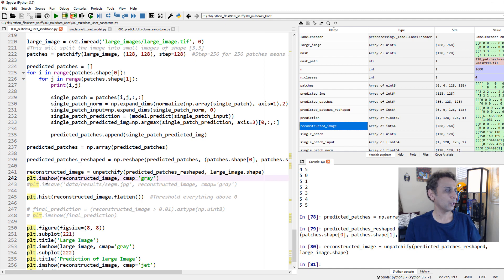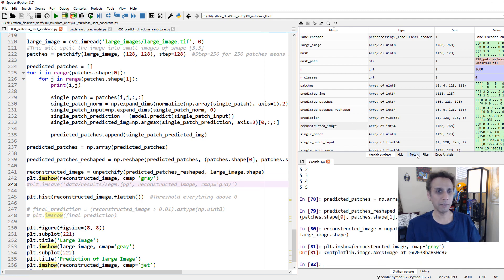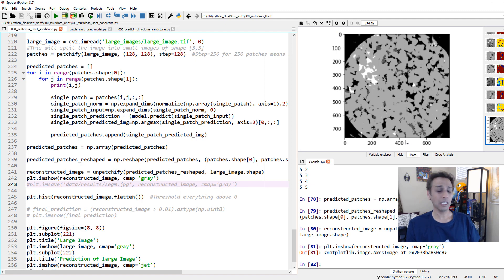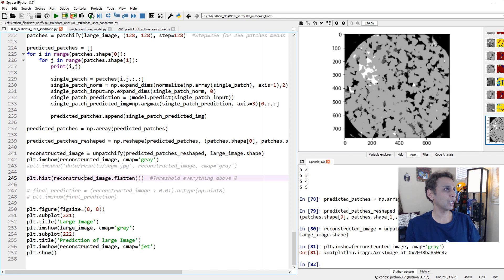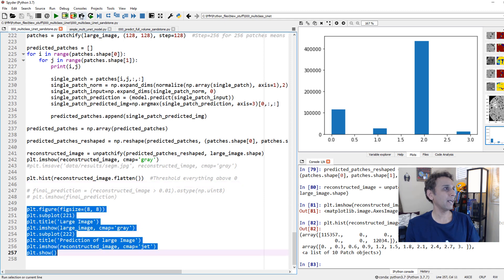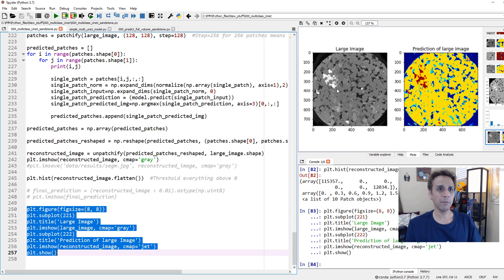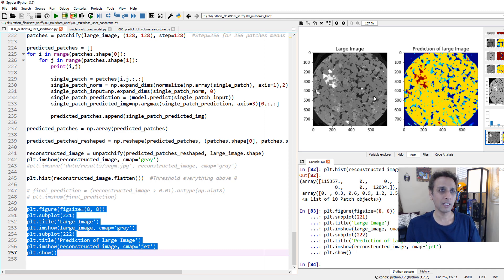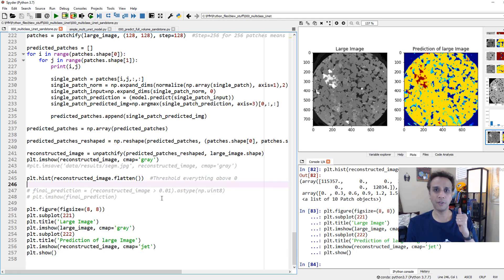Let's have a quick look at this reconstructed image. The prediction doesn't look bad at all. Looking at the histogram, we can see class 0, class 1, class 2, and class 3 - all four classes are present. Showing input and segmented images side by side: the bright regions appear in red, this area in yellow, dark regions in dark blue, and the clay shows up in a nice light bluish color.